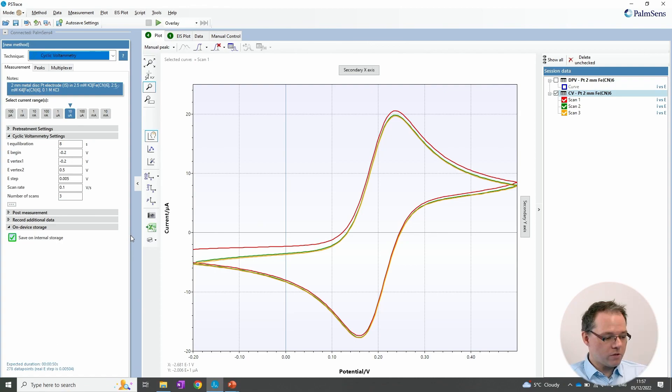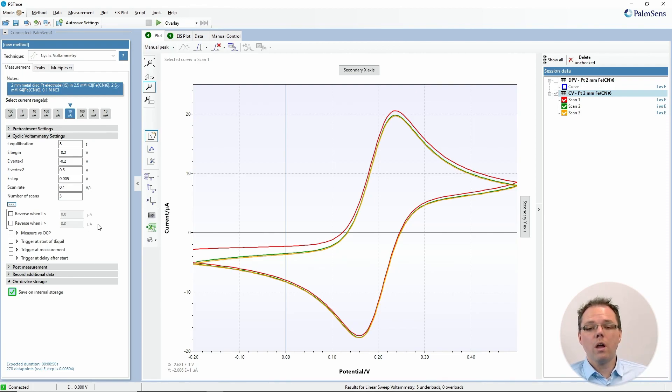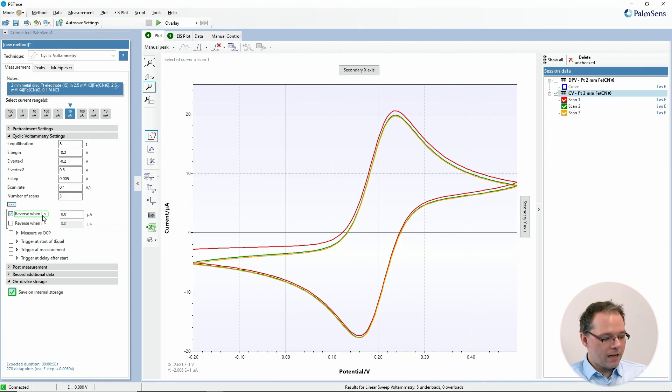Those are the standard parameters. In PS-Trace there are a few more, hidden under the advanced options button — which sounds fancy but is just these three dots you click to get a few more options. One of them is criteria for reversing: if you don't know at which potential you want to reverse but you know you want a certain current for reversing, you can check these options and select the current value at which you want to reverse.